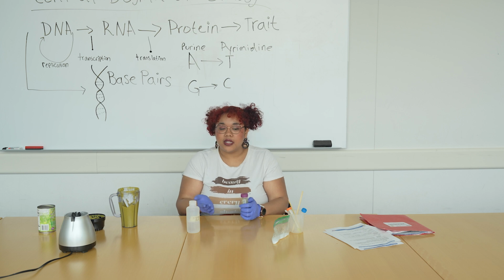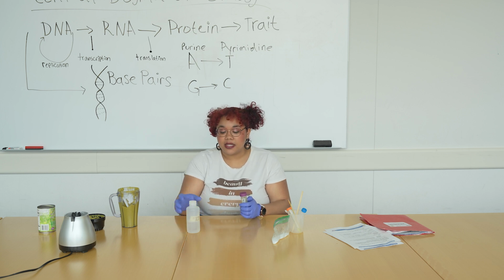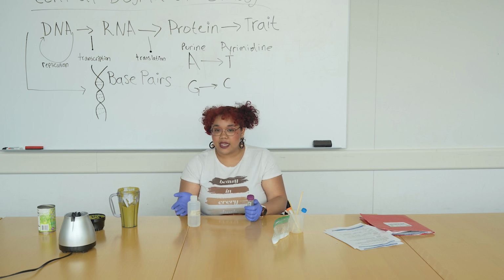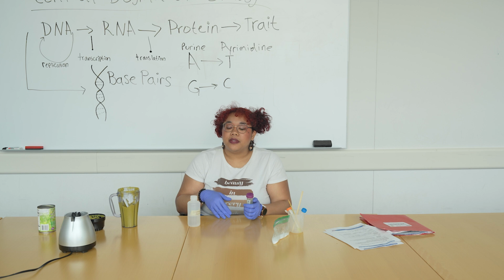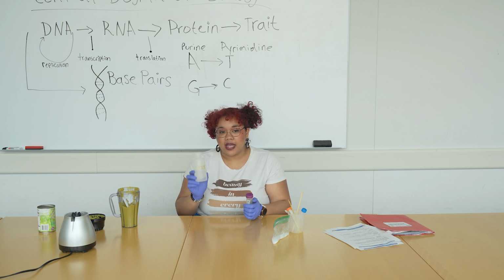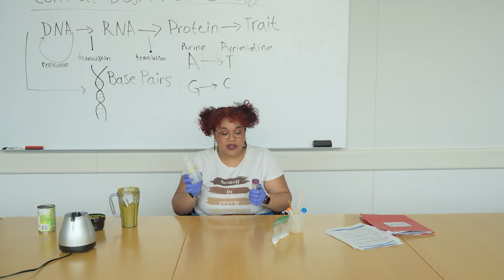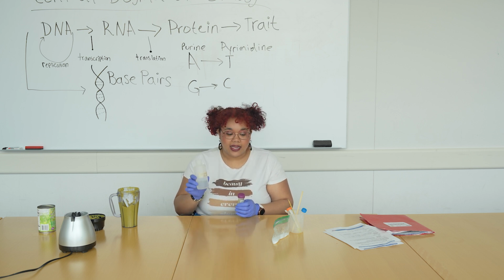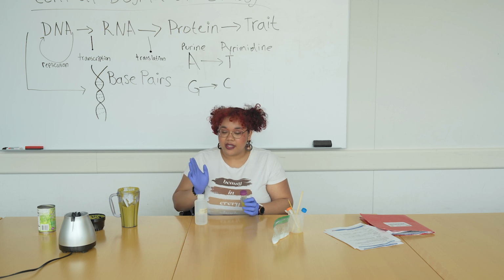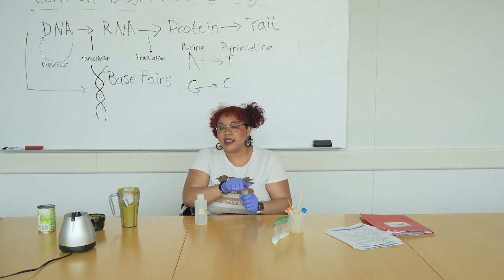And so now what we're going to do, and this is going to be a very critical step, is to add our alcohol. And like I said before, DNA dissolves in water. And so for us to be able to see it, we got to add something like alcohol, which it cannot dissolve in. And so when your students are ready to have the alcohol added, it'll be very important that they are very gentle when it comes to adding the alcohol.